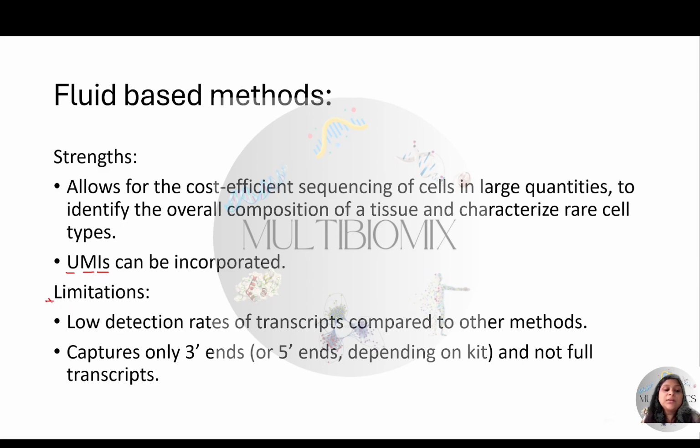But there are some limitations for fluid-based methods. Obviously, a fluid-based method means it will incorporate a liquid phase, right? Or a gel phase. So we can quantify more cells, but the detection rate of the transcript is less. Okay, and depending on the platform, it does not capture whole sequences.